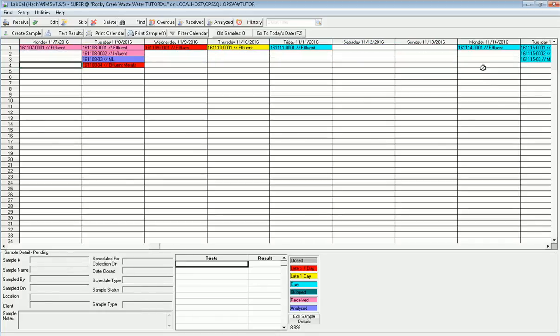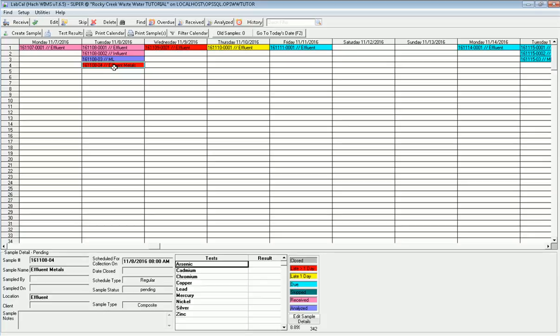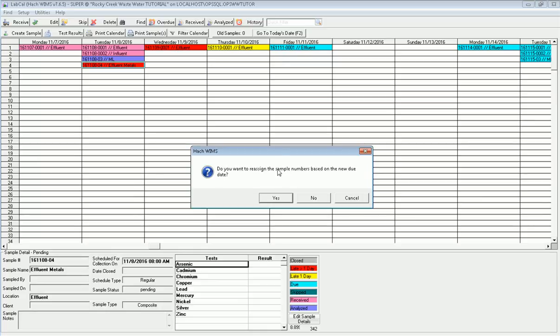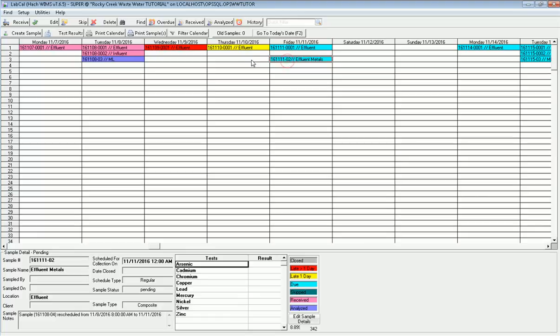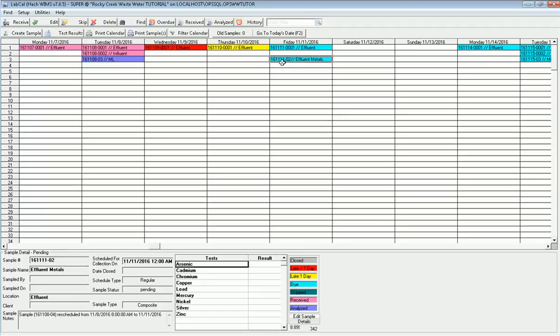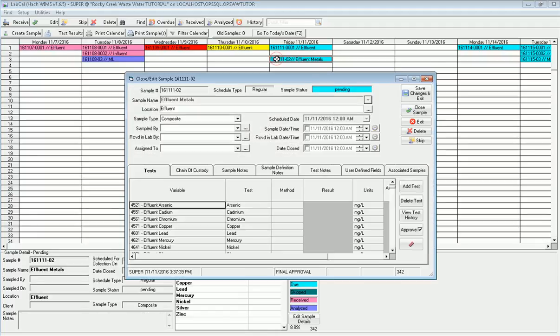If you have the rights, you can reschedule it. You can say, you know what, this one I'm just scheduling. I'm going to put it that I actually need to take the sample today. It says, do you want to reassign the sample number? I'll say yes. So it gives it a sample number that's year, year, month, month, day, day, and it's the second sample on that day. I got my effluent metals. It does have a note now that I drag and dropped it so you know you originally rescheduled it. When I reschedule a sample, it has no effect on the future schedule of that sample. The one in December is still scheduled on the second Tuesday of December.